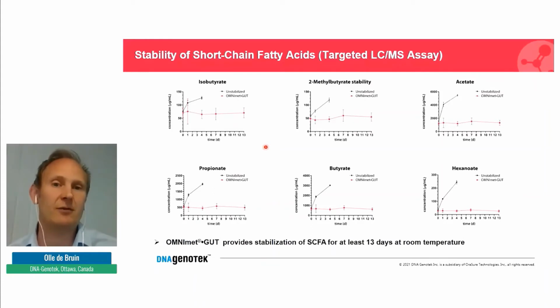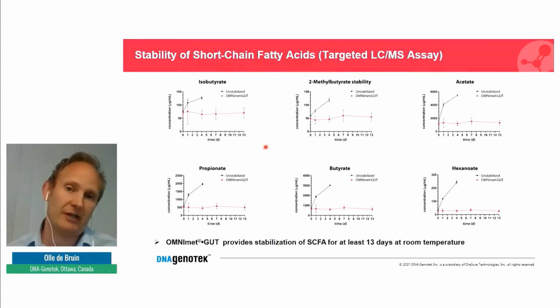We performed targeted LC-MS analysis, again with Metabolon. So we looked at 8 short-chain fatty acids. Here we show the results of 6. They all perform the same, all 8.